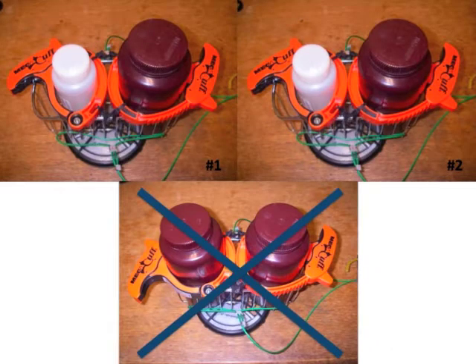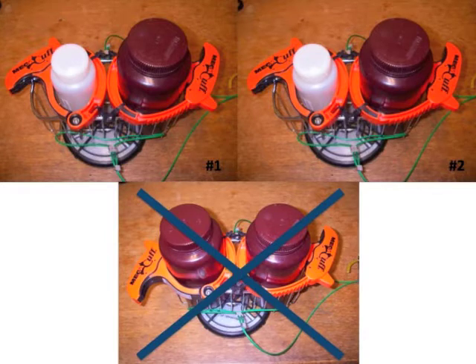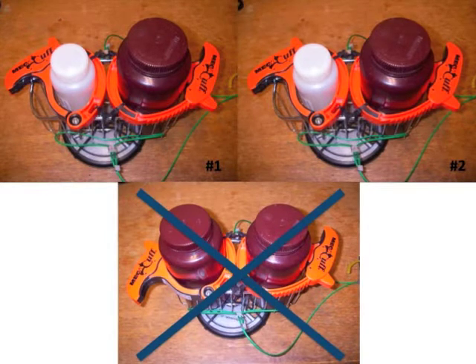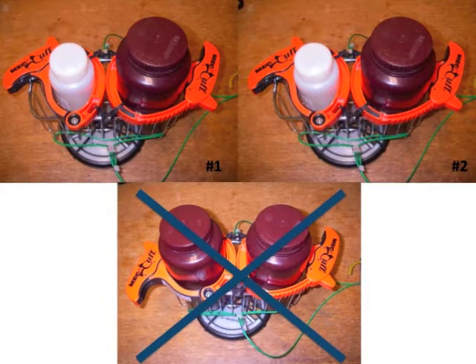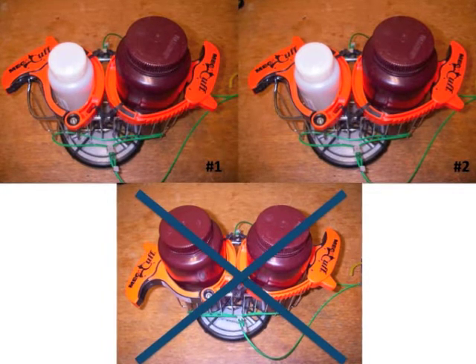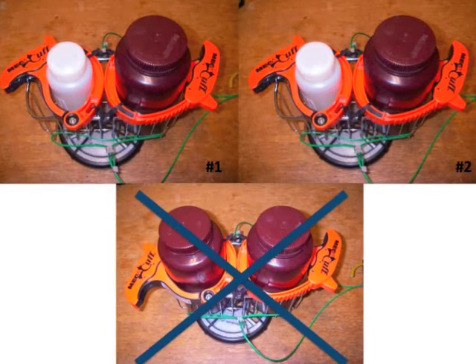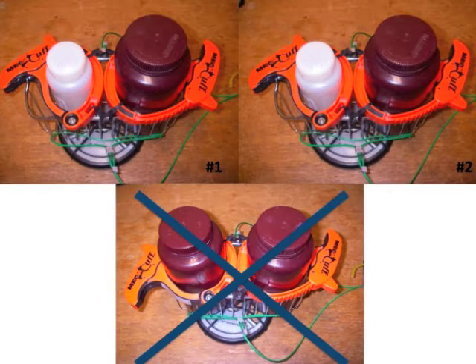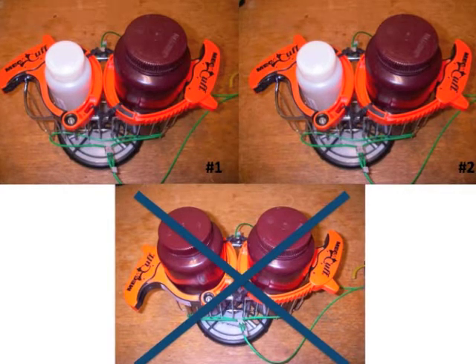If you are asked to take a field duplicate when you are also sampling for nutrients, you will have 4 bottles in total. To sample, you can load the regular bacteria bottle and the regular nutrient bottle into the same basket, take those samples together, and then load both field duplicates together for the second deployment of the basket. Please note, you do not have to rinse the basket 3 times between these 2 steps. Finally, as with the bacteria samples, the regular nutrient sample and its field duplicate should never be taken together.